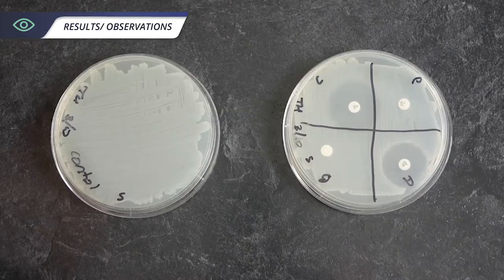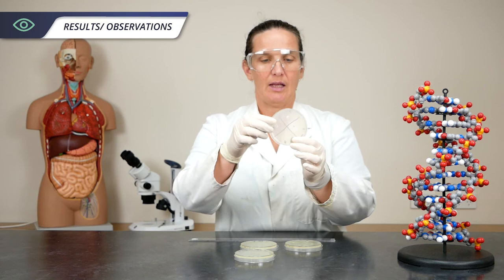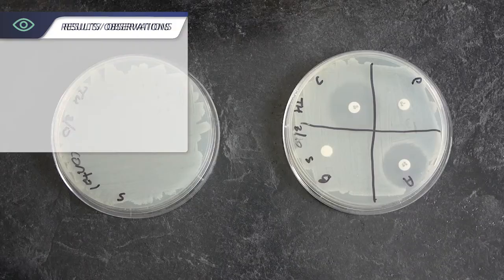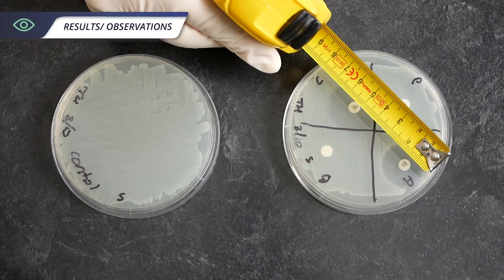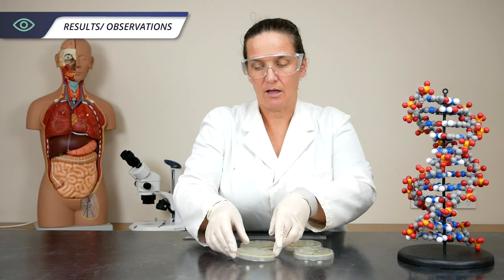It's been 24 hours since we put our plates into the incubator at 37 degrees. We now have a nice lawn of E. coli, and around some of our antibiotics we have a clear circle — that's the zone of inhibition, which means that the antibiotic has worked against the bacteria. Against penicillin and the blank disc there's no zone of inhibition, meaning that penicillin does not work. All we need to do now is measure those zones of inhibition and write them down in our results sheet.